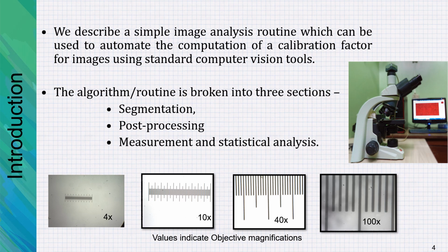In this presentation, we discuss a simple image analysis routine or algorithm to compute the calibration of images taken under a microscope using standard computer vision tools. We have divided it into three sections: the segmentation, post-processing, and measurement and statistical analysis.